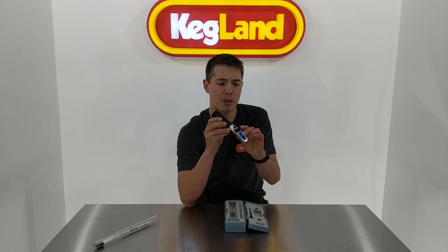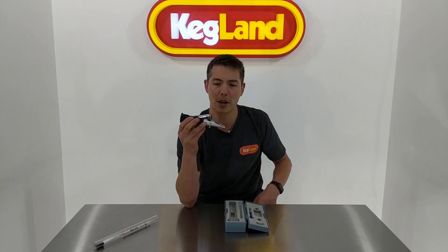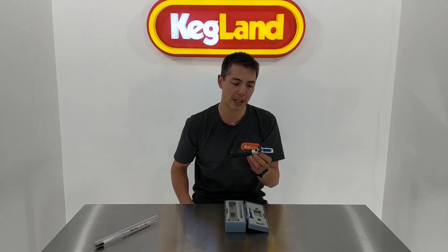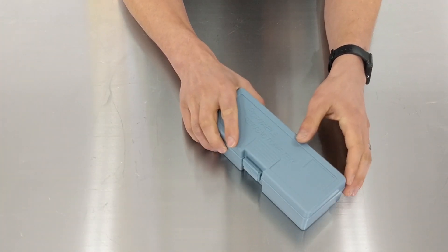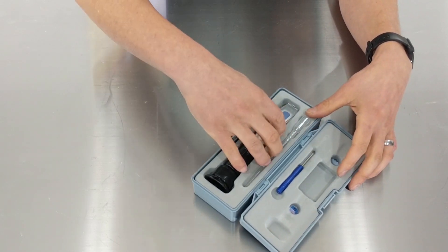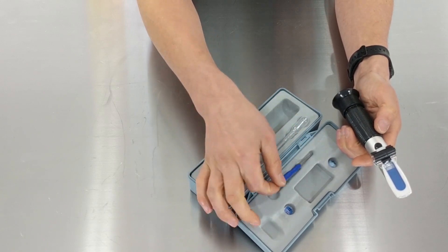You can still use it as a traditional refractometer if you run out of batteries on your brew day — just use a normal light source or step out into the sun. The LED function just takes a few little button cells. Now the first thing you'll notice is they come in a nice hard case like this, and inside we've got the refractometer, a pipette, and a little screwdriver for calibration.